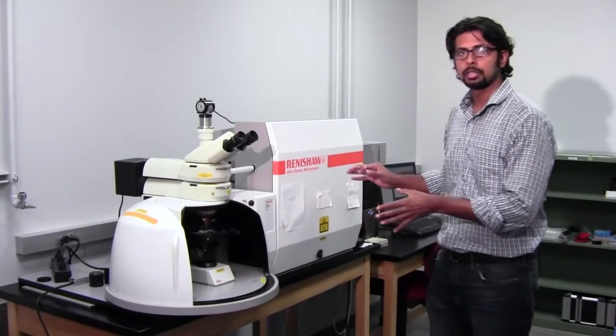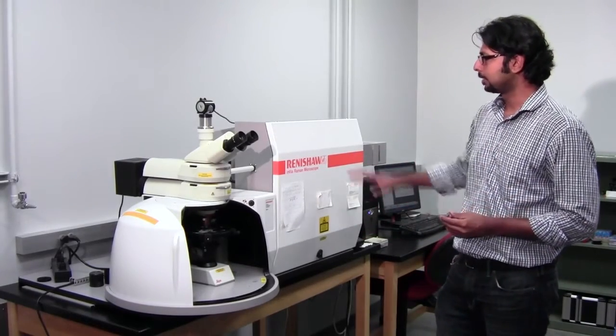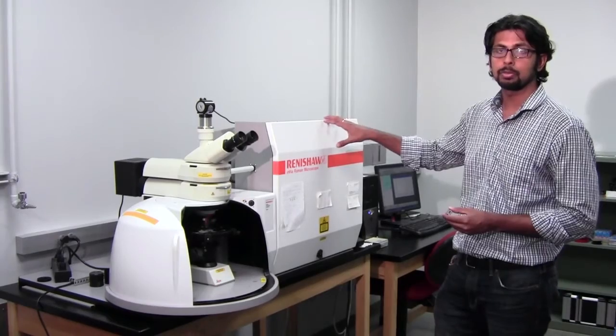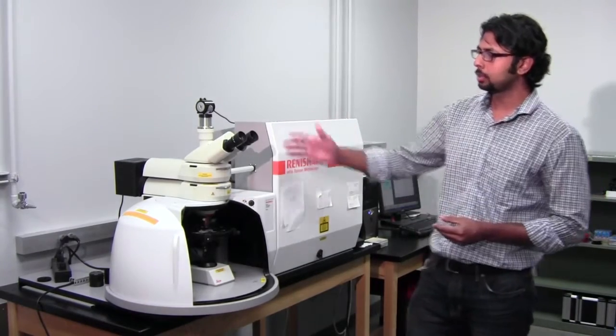So far you've heard about what the Raman spectrometer does and how it works. Now what I am going to show you is how we actually use Raman spectroscopy. This is the Raman spectrometer. It has got two units. This is the place where the light gets generated and this, as you can see, is the microscope.